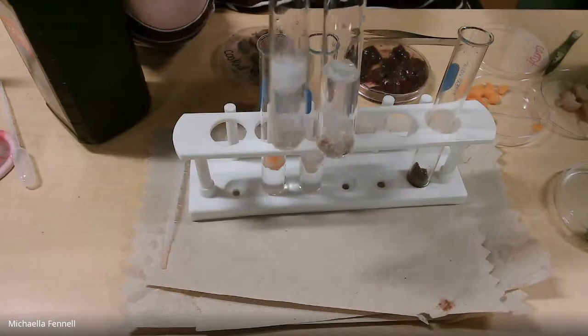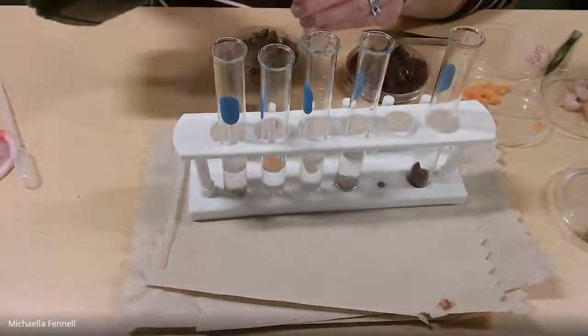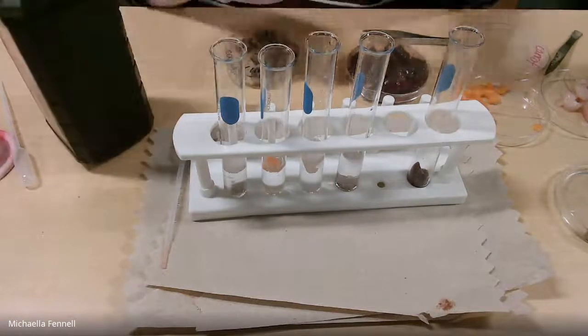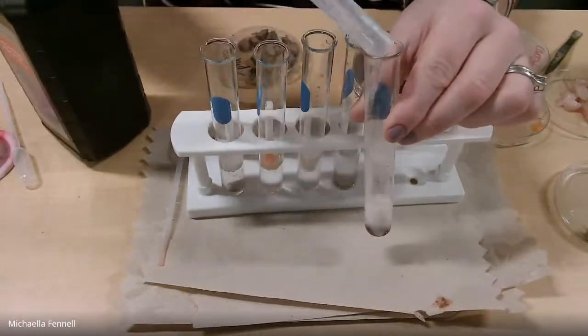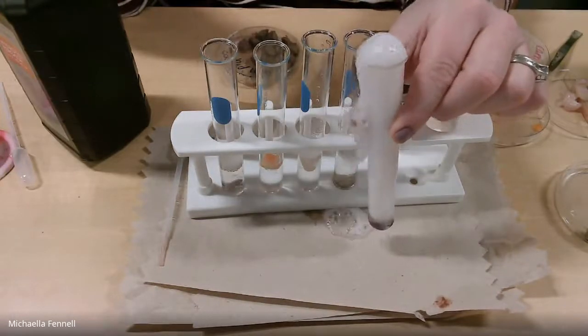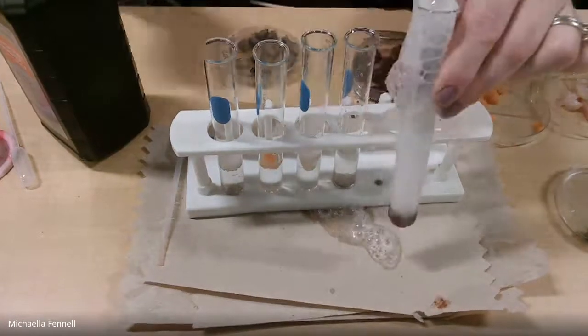All right, and then our last one. Better get this done before everybody comes in here. Our last one is the raw liver. Are you guys ready for this? I'm going to make sure you get a good view of this. There's our raw liver, adding the hydrogen peroxide. Oh no, oh no, oh no. All right. Raw liver, by far, of course, has the most catalase.